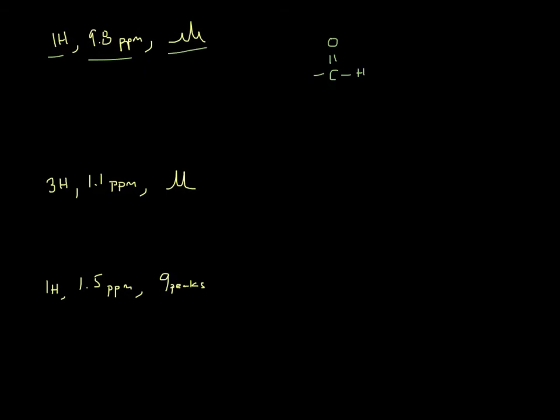Interestingly, it's got a triplet. A triplet, of course, means that it has 2 H neighbors.